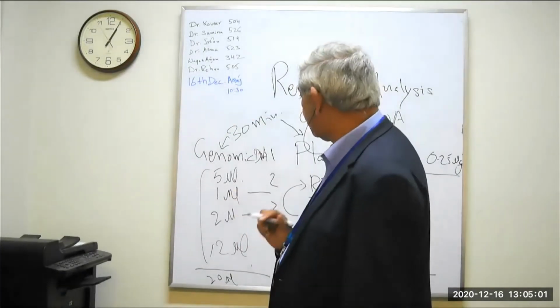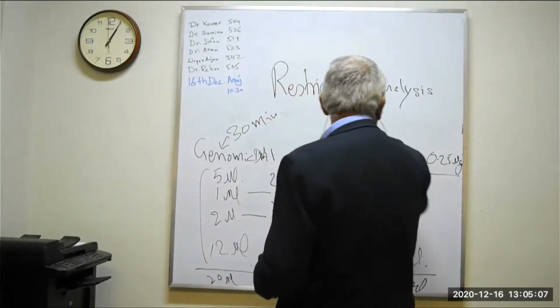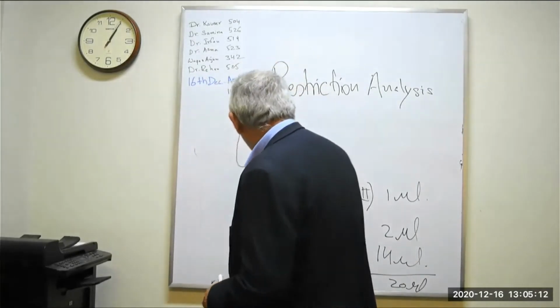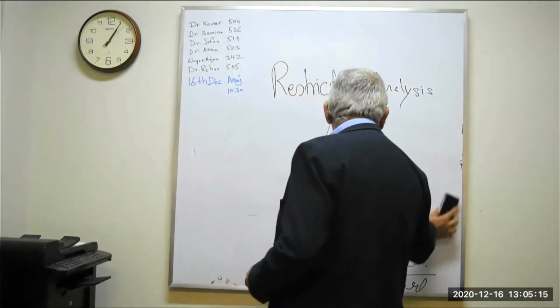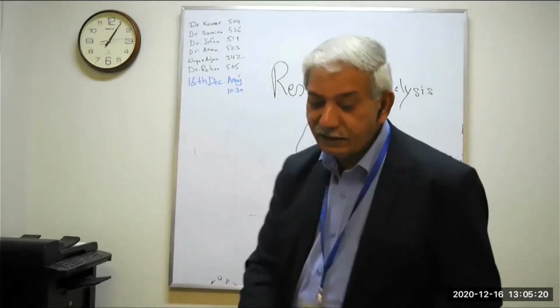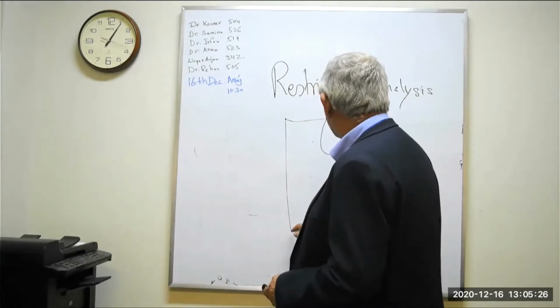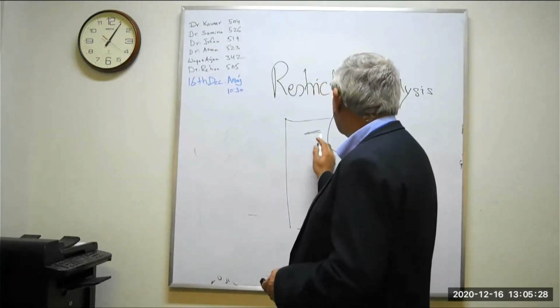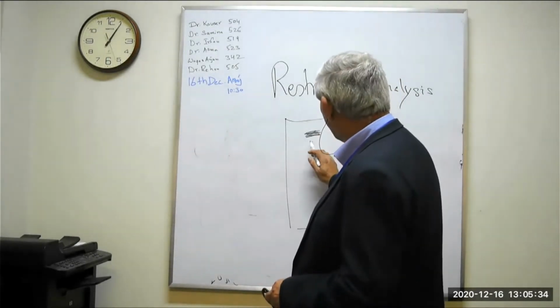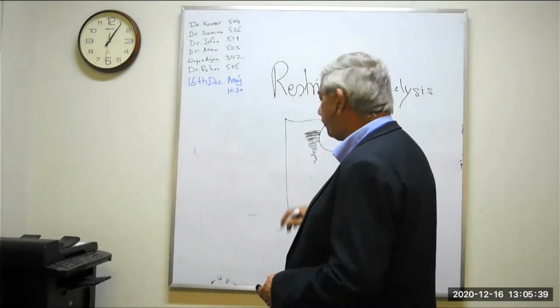The reason is that partial digestion means all the genomic DNA is not completely cut by PVU2, and we can see a lot of genomic DNA close to the well, and then the remaining DNA which has got cut by the enzyme. This is the thick band of the chromosomal DNA that I'm expecting to see in the well after partial digestion, and then some smear appearing from here.